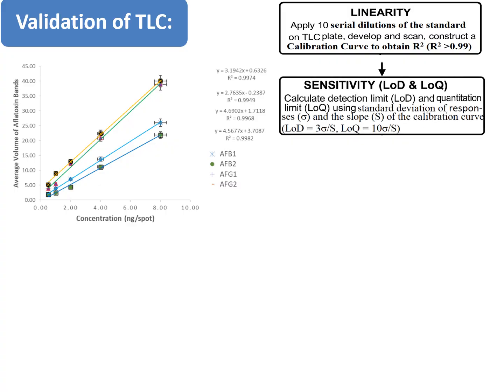Now, the second aspect that is being assessed during the validation steps is the sensitivity of the method, that is the limit of detection and limit of quantitation. Determination of the limit of detection and quantitation of the method.